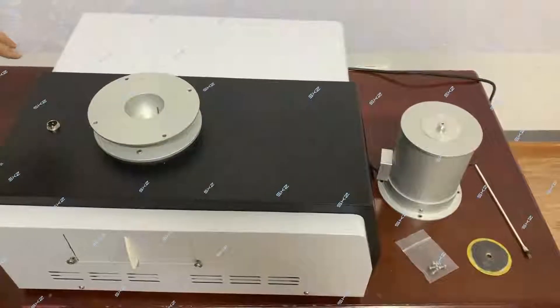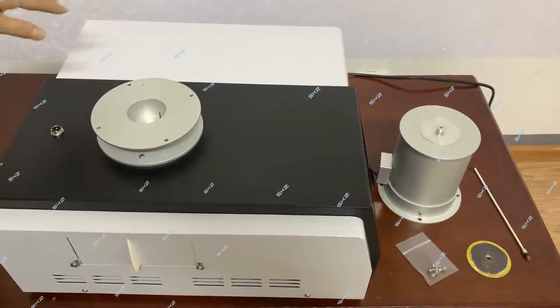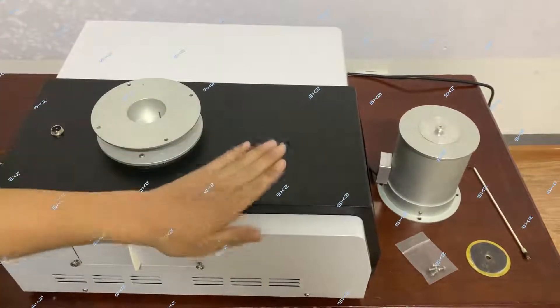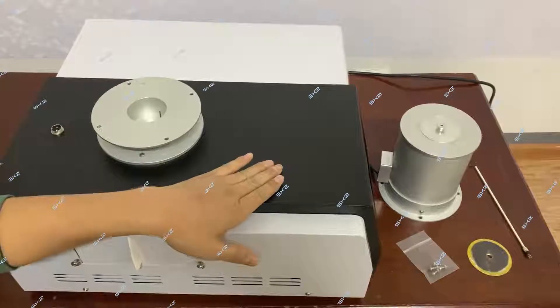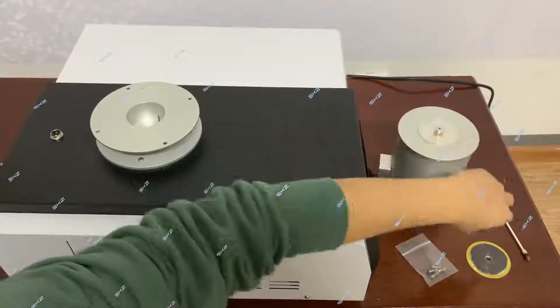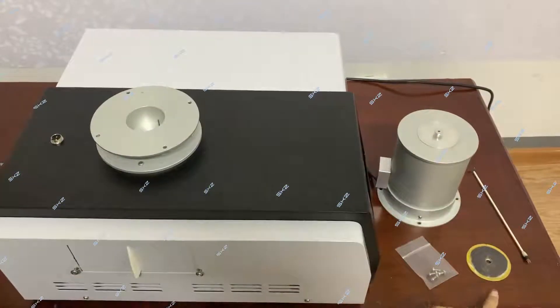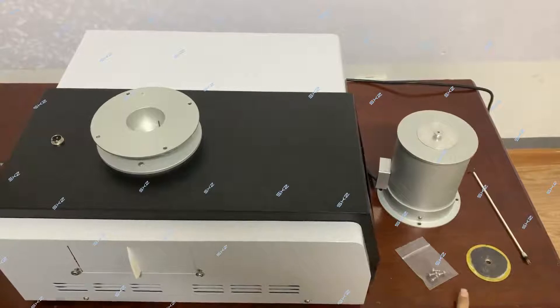When you receive the equipment, now like this, this is the main machine, this is the furnace, this is the sensor, this is a weight block.